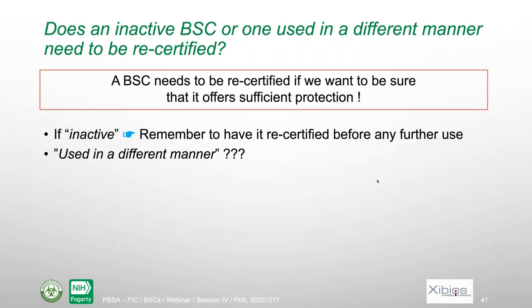Does an inactive biosafety cabinet or one used in a different manner need to be recertified? Actually, used in a different manner, I don't know what that means. I don't know how you could use a biosafety cabinet otherwise than as a biosafety cabinet. Anyways, if your biosafety cabinet is inactive, of course you don't need to recertify it. You only need to recertify it if you want to be sure that it offers sufficient protection.